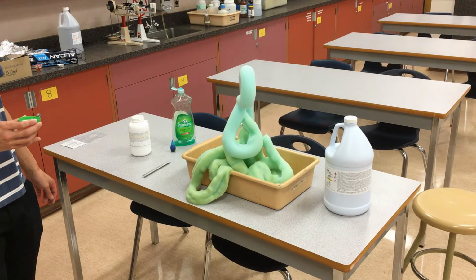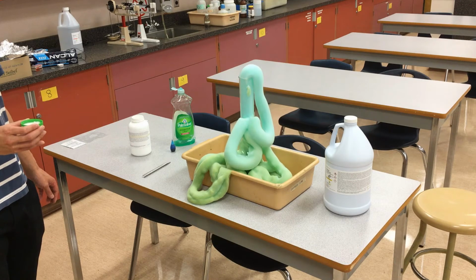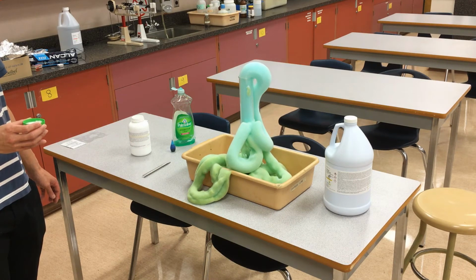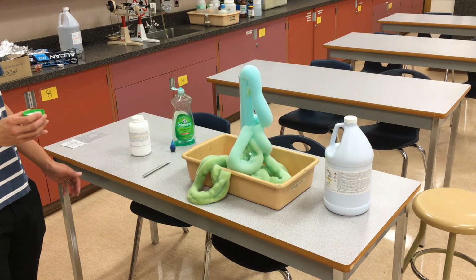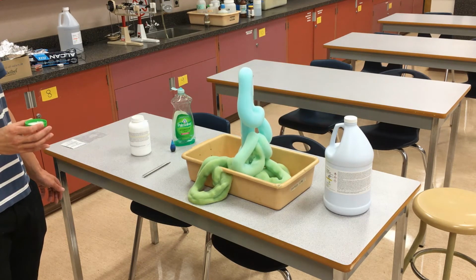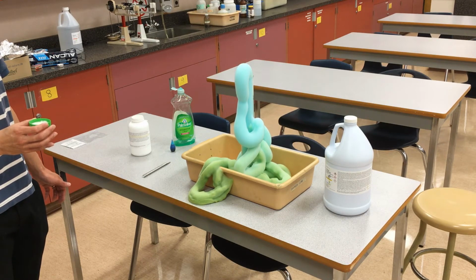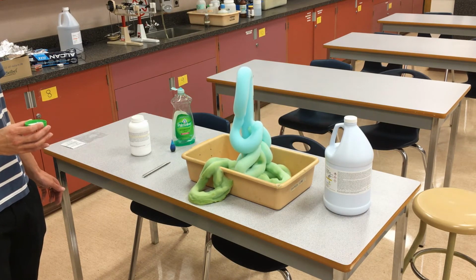Basically what's happening here is the gas is being trapped under the soap bubbles, and that's why it's caused to foam upwards like this. If you YouTube elephant toothpaste, you'll see different versions of this. They play around with different concentrations of hydrogen peroxide, different catalysts, different amounts of catalysts as well. Okay, but there you go, that's the catalyzed decomposition of hydrogen peroxide.